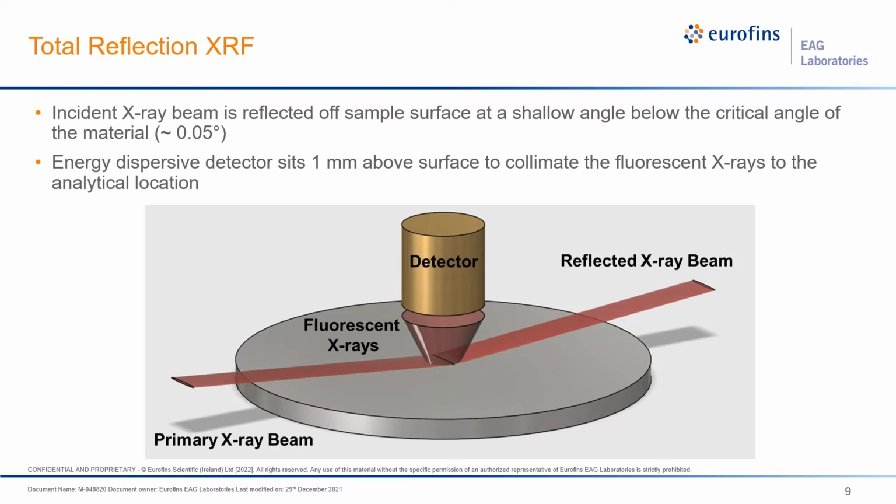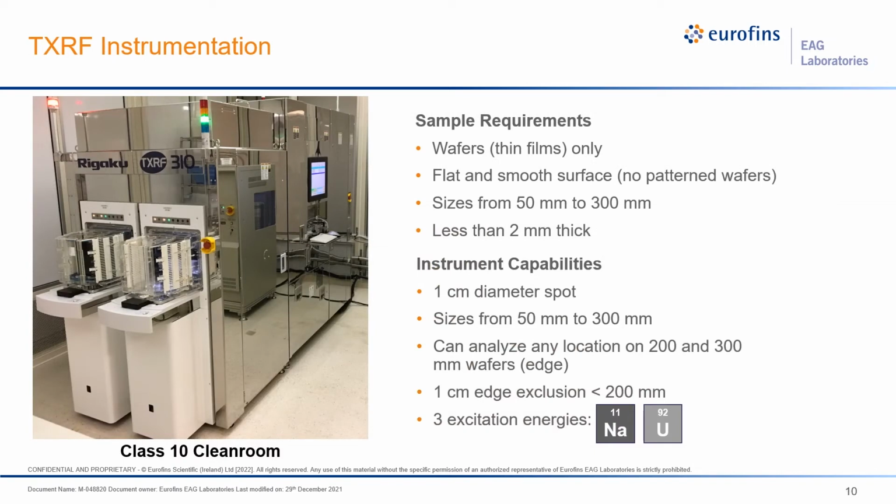Now I want to highlight our TXRF instrumentation and the sample requirements. We've actually been conducting TXRF analysis since the early 90s, going through many different instruments. And we recently upgraded to a Rigaku TXRF 310 instrument, which is shown here on the left. It's a very nice, shiny mirrored box for the most part.